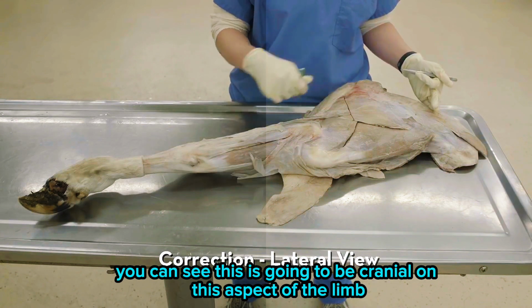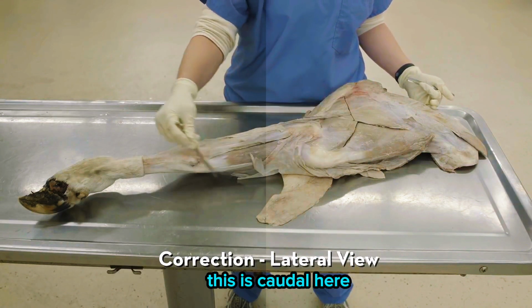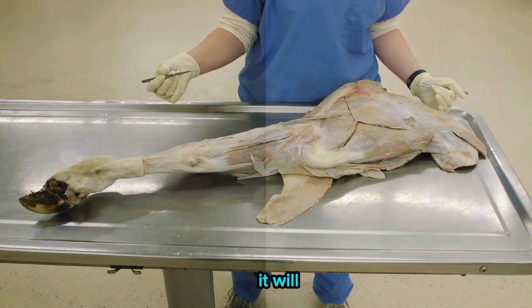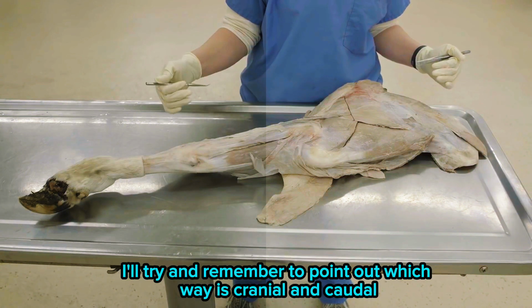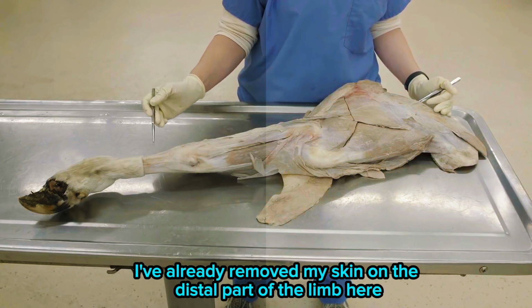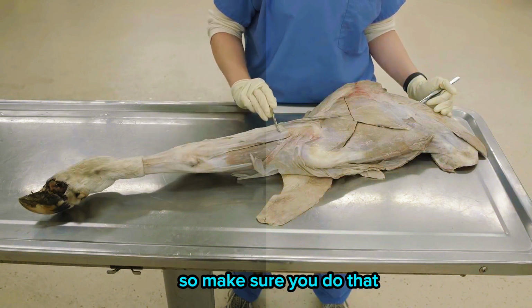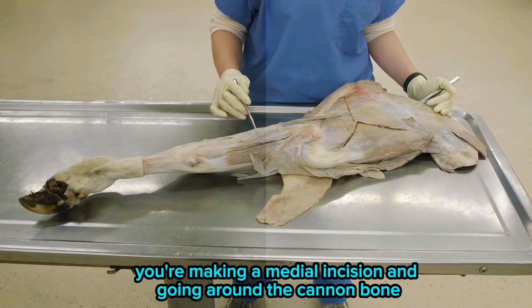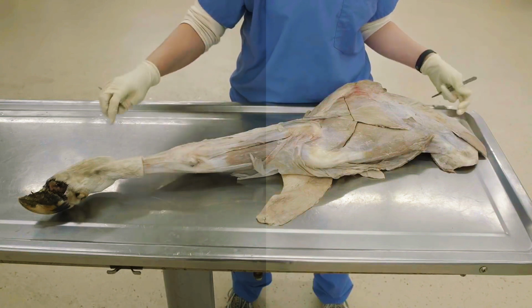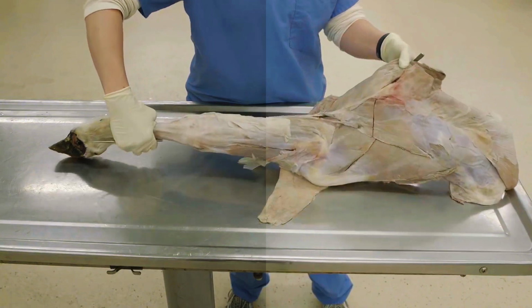You can see this is going to be cranial on this aspect of the limb. This is caudal here. As I turn it and look at the different things in this limb, I'll try and remember to point out which way is cranial and caudal so that you don't get disoriented. Here I've already removed my skin on the distal part of the limb, so make sure you do that. You're making a medial incision and going around the cannon bone, removing that skin. So I'm going to flip the limb over to the medial side slightly.